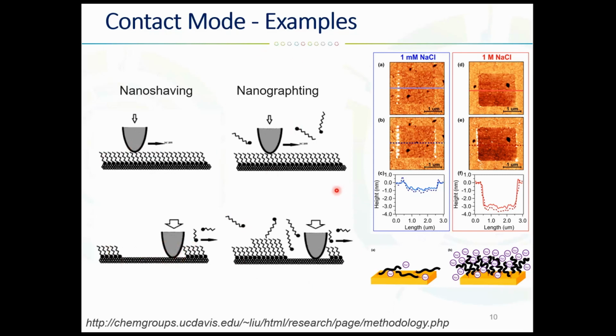And in the middle is nanografting. In the medium, you can see a different type of the polymers. So here is just like with a longer tail. So when you conduct this nano shaving procedure, you have a free space left. So these new type of the polymers will be attached to the surface, or absorbed, and that's how you can basically do lithography, so-called lithography.